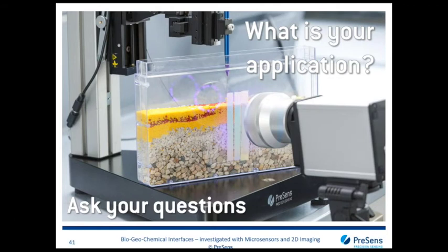Okay, the first question is, can I also profile with the microsensors in soil samples, not only in sediment samples? Martin, can you give us an impression on that? Yes, you can. Soil is also possible. As Robert said before, if you do pH or CO2 measurements, the soil needs to be moist. As long as you've got 100% humidity and can actually detect pH, you can also measure it with the microsensors.